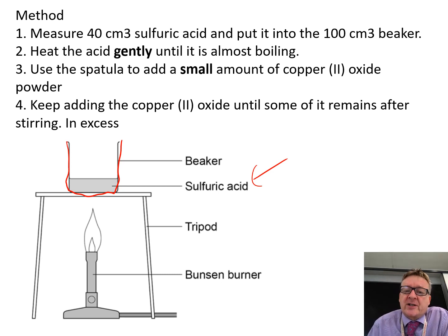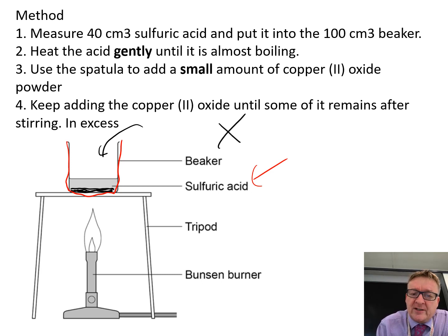Use the spatula to add a small amount of copper 2 oxide — the black copper 2 oxide goes in and it reacts. You keep adding the copper 2 oxide and stir it. Eventually you'll see some black copper 2 oxide staying at the bottom even after stirring. That means the copper 2 oxide is in excess — you've got more copper 2 oxide than needed, or all the sulfuric acid has reacted.